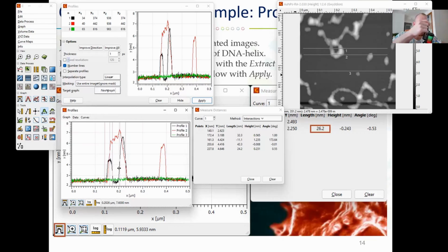Feedback goes up and up, and then you start scanning the surface of your impurity or your sample. And that's why sometimes it's very tricky, without knowing the exact shape and exact parameters of the tip, to measure the width, but it's super precise when you're measuring height.